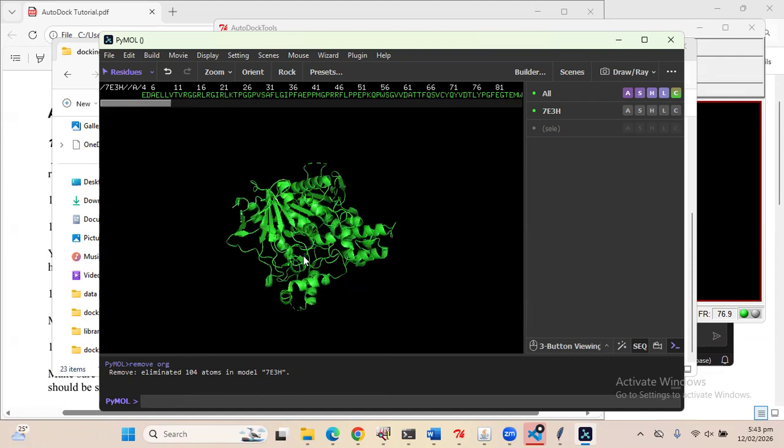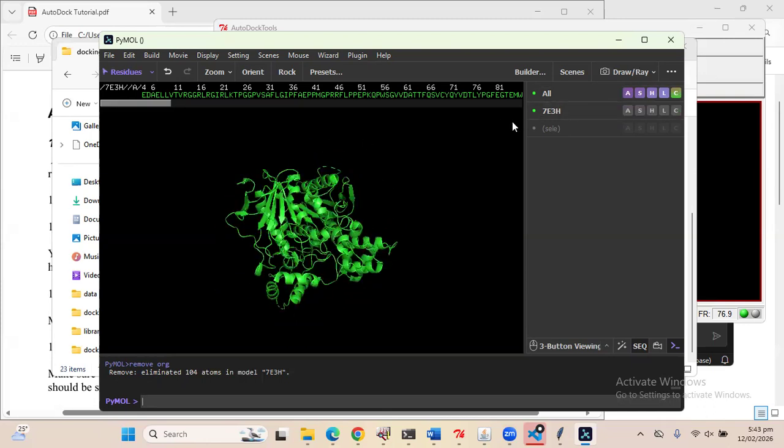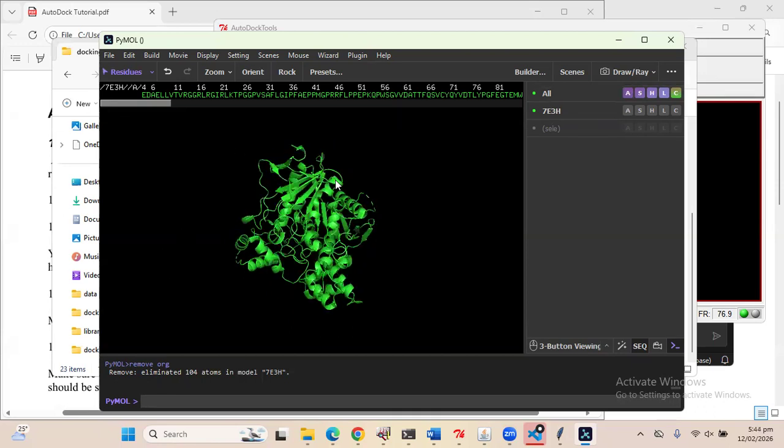These are commands which just make your life easier, with only a single command. So this is the power of the command prompt. Therefore, we have started our work to know how these command prompts work. If you want to become a master of PyMol, you need to learn the different commands of PyMol. Although we have these commands which you can use here, the extra chains are removed, waters are removed, organic molecules are removed, and this protein is now ready.